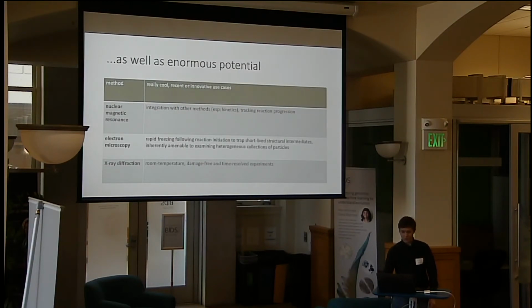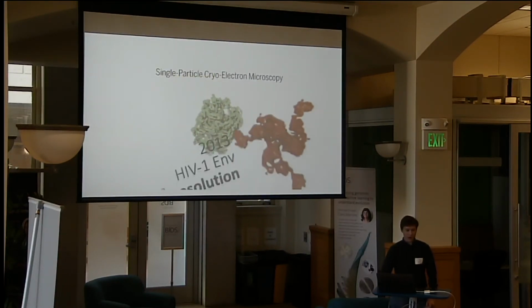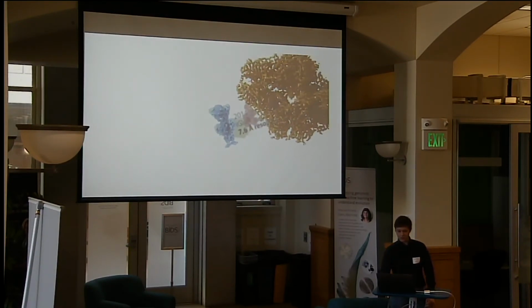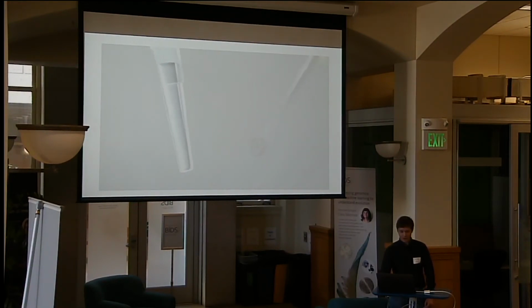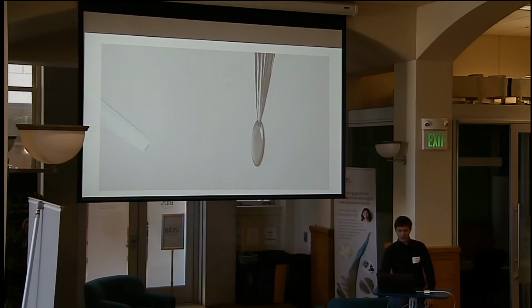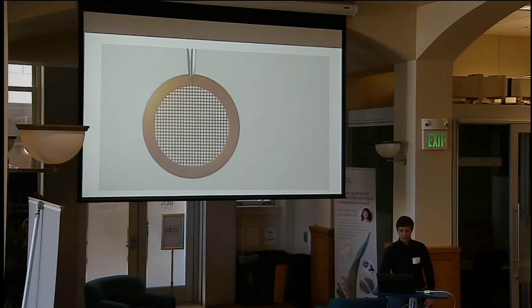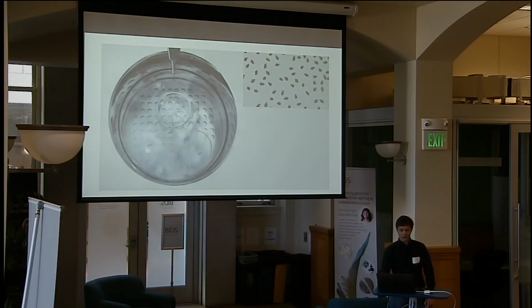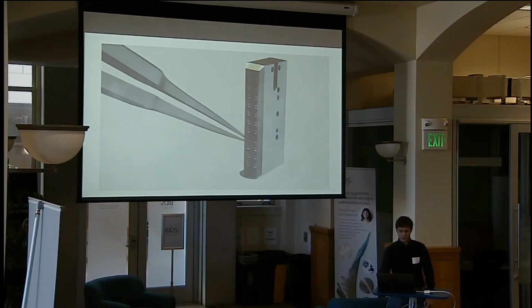So here's just a really quick video for those who are not microscopy experts on the protein scale. These are the kinds of resolutions that we're able to get now, 3 angstrom-ish. You can deposit your aqueous sample on a grid and blot it to get an extremely thin layer, hopefully still with liquid. Everything's still moving around at room temperature, and then as quickly as you can, you plunge it in liquid ethane and then move it to liquid nitrogen for imaging.